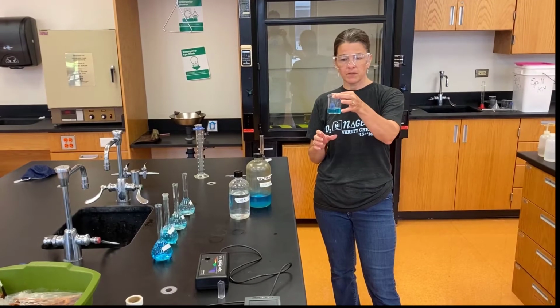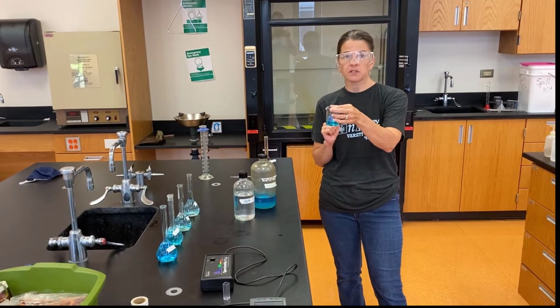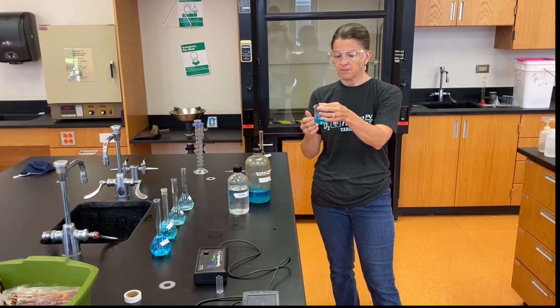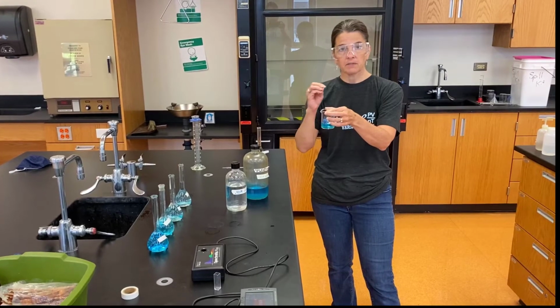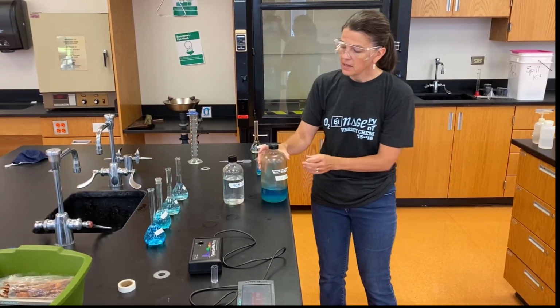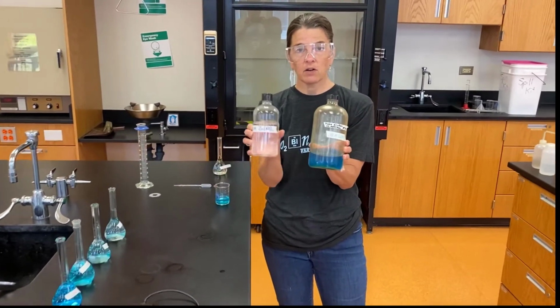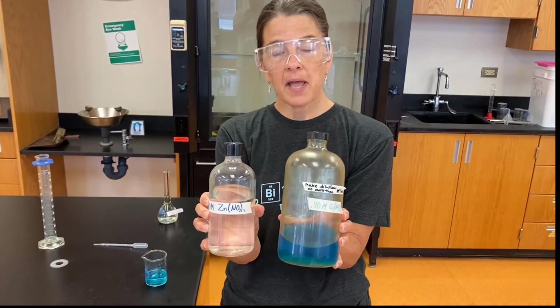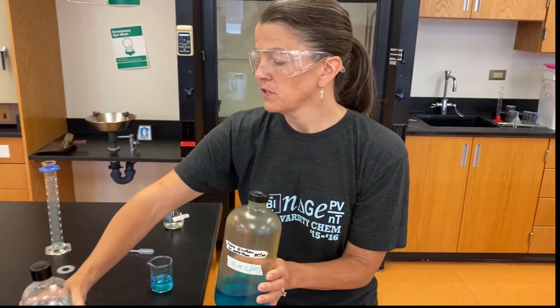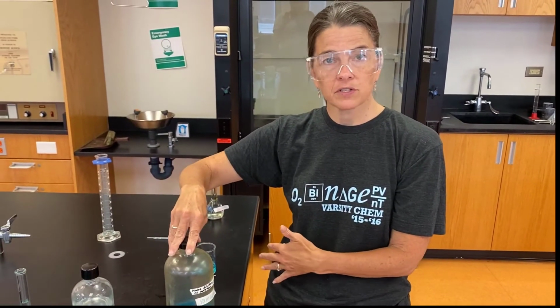Okay, so here we are on day 2, and this is the beaker that we've come back to. This one was actually the brass pellet, and you can see that we have a blue solution. Well, our brass was a mixture of zinc and copper, so when it reacted with the nitric acid, it created two things: copper(II) nitrate and also zinc nitrate. And what we have in that beaker is actually a mixture of the two. But what we're trying to do is focus on what amount of copper we have in this solution.